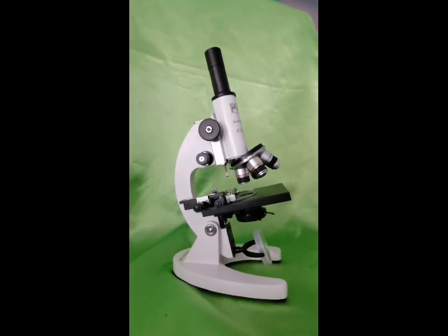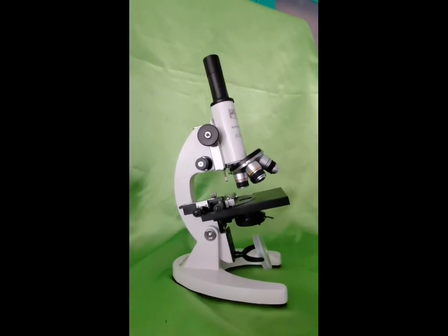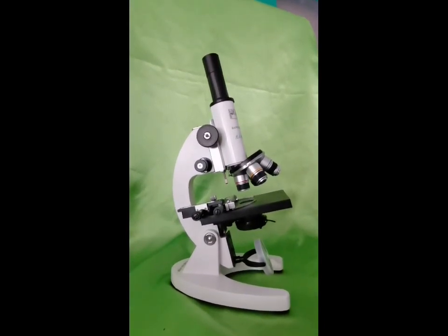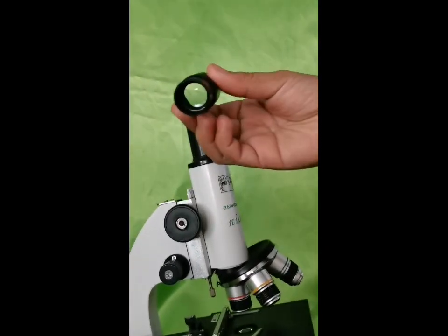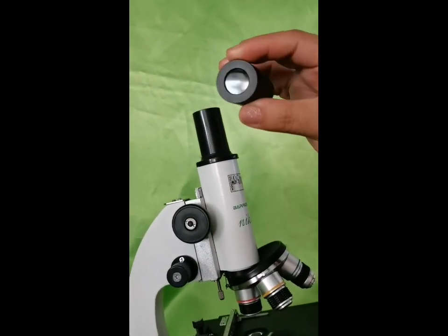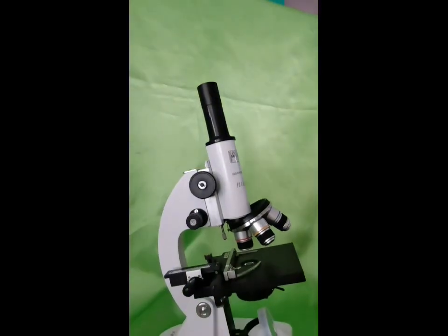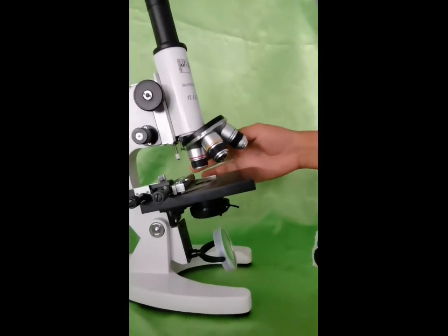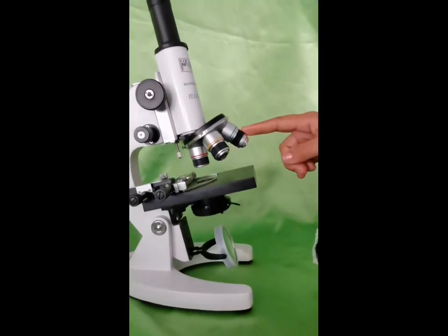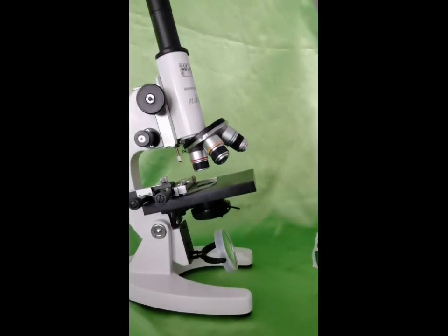First is the magnifying parts, which include the eyepiece or the ocular. This eyepiece is a lens that is attached to the draw tube. It is where you look through when observing a specimen. Next are the objectives. These are attached to the revolving nosepiece, and these are responsible for holding the objective lenses. There are different types of objective lenses.